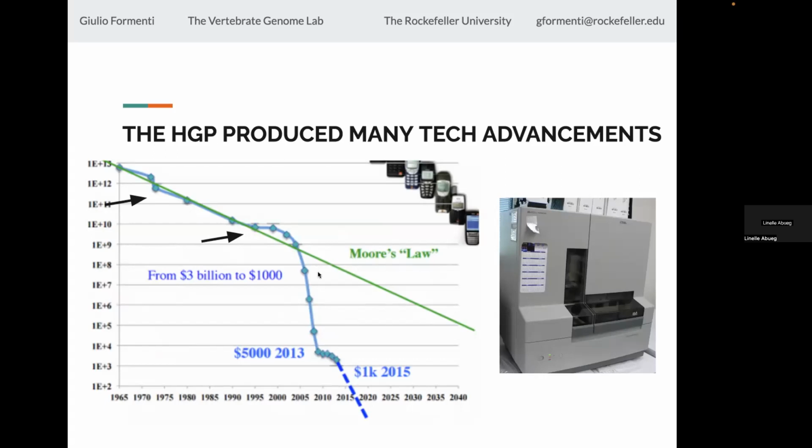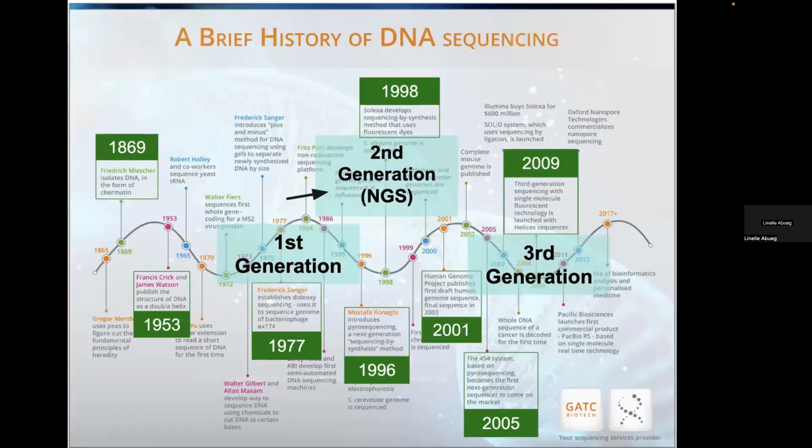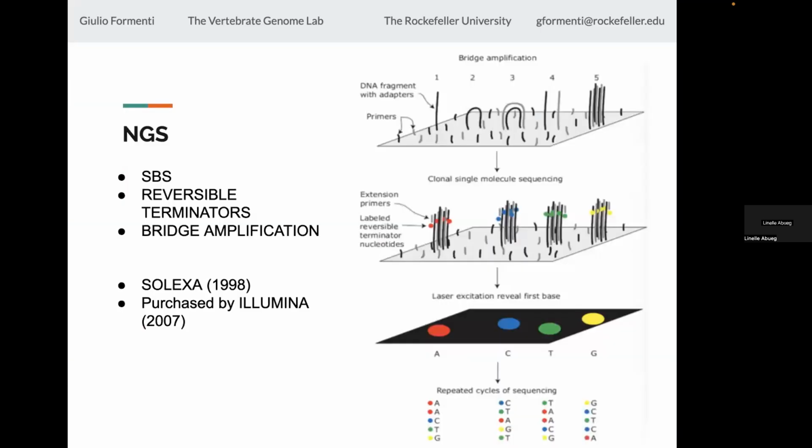Yeah, this is a very, very significant increase as represented here. So that's how we get to second generation sequencing. Even the human genome was not completed using anything close to Illumina. It was essentially Sanger sequencing at scale. Then we have what's called next generation sequencing.